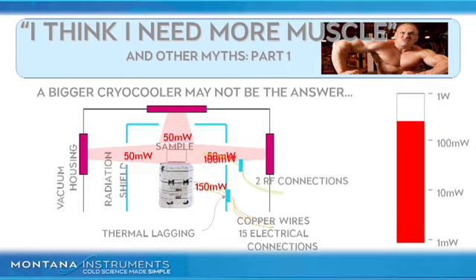Let's also put some RF connections in there as well. You might add 100 milliwatts for 2 coax RF cables. We've accumulated a significant heat load.